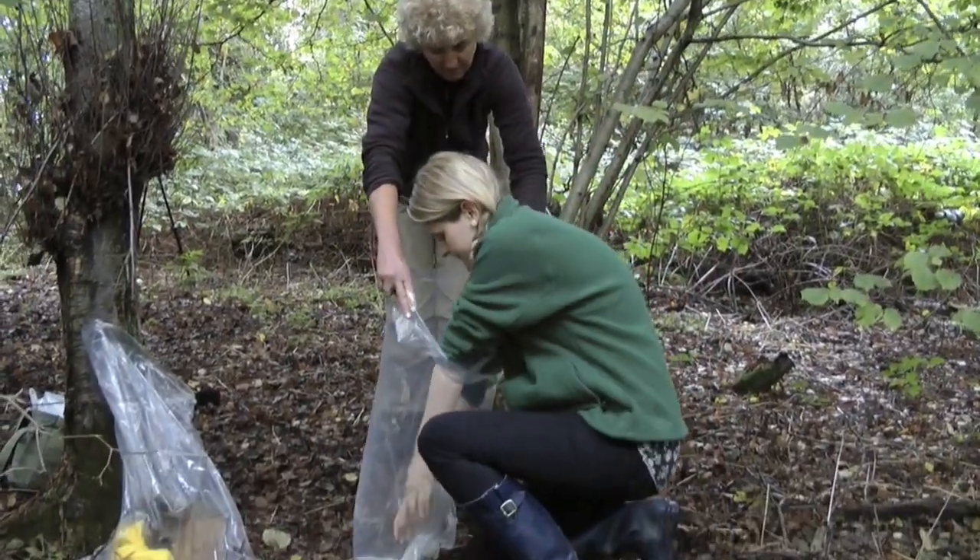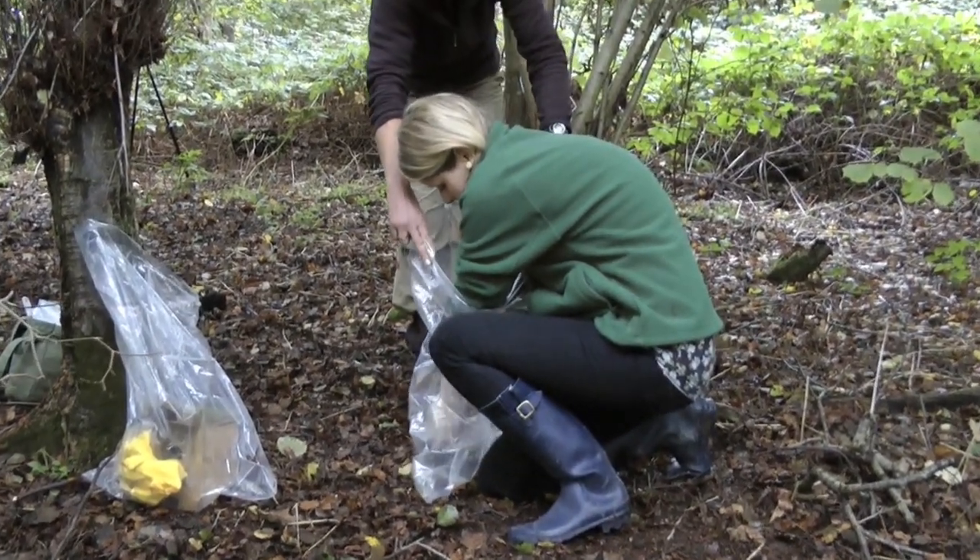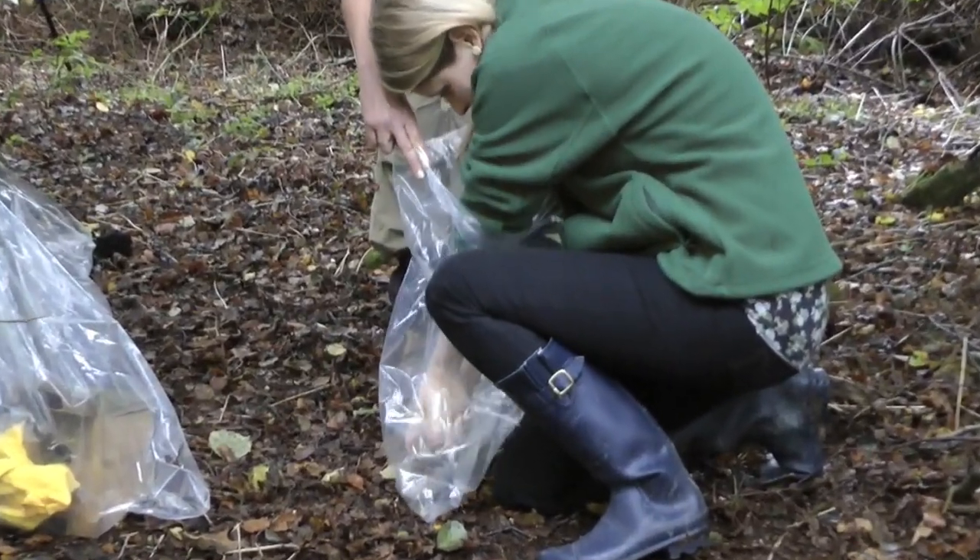Keep the sides of the bag up and with both hands in the bag catch the dormouse, being very careful not to grab the tail.